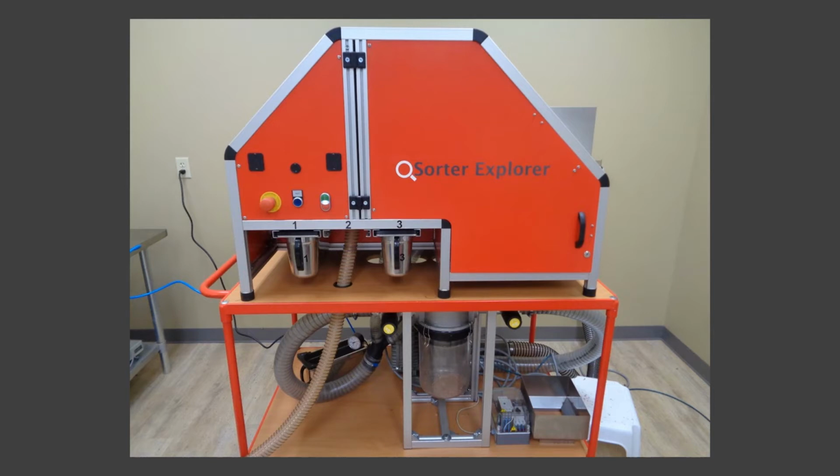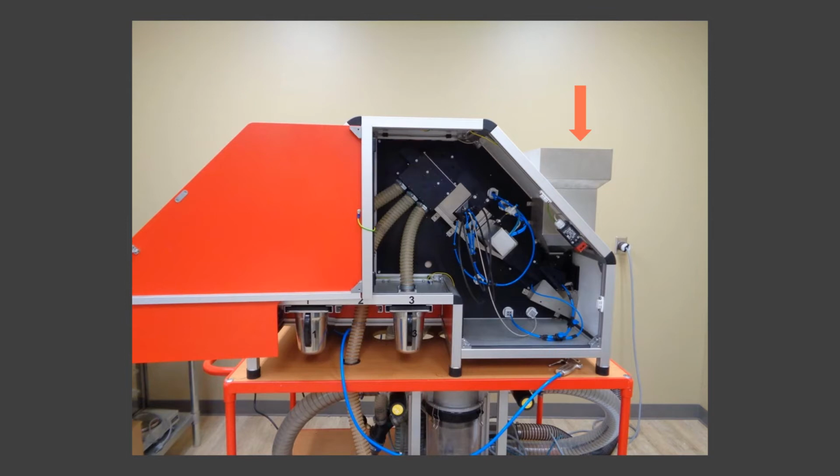First, a sorting property is selected using the computer program. For this study, we selected oleic acid. A batch of peanuts is loaded into the hopper. The air pump below provides a vacuum system to pull kernels onto the unique belt delivery system, which allows for fixed position delivery of the individual kernels to the vision and NIR systems.